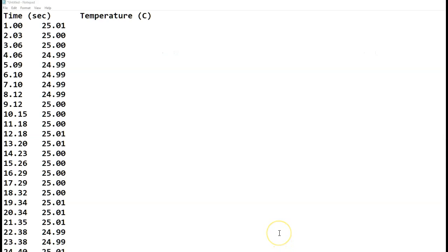Okay, here is the data for reaction 2, which is the solid sodium hydroxide reacting with the aqueous hydrochloric acid. And so we started at 25, remember, and find your maximum temperature to get your final temperature, and you're going to do the change in temperature, final minus the initial. So take the highest, the ending temperature minus the beginning temperature. That's how we do delta T. And use that for reaction 2 data. Okay, and then I'm going to stop, and then I'm going to get you the reaction 3 data, and then you can have all your data. So I'm going to pause for a sec.